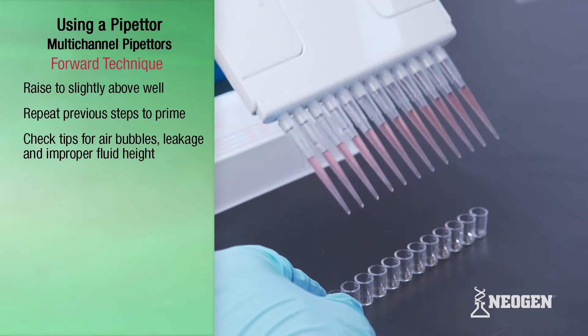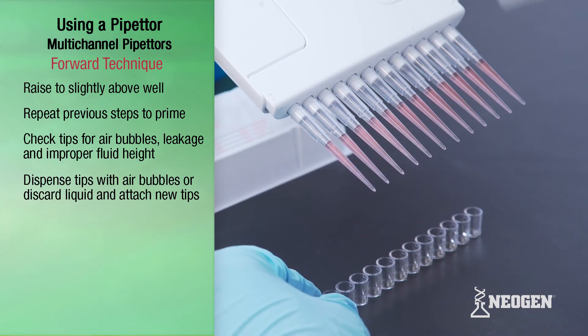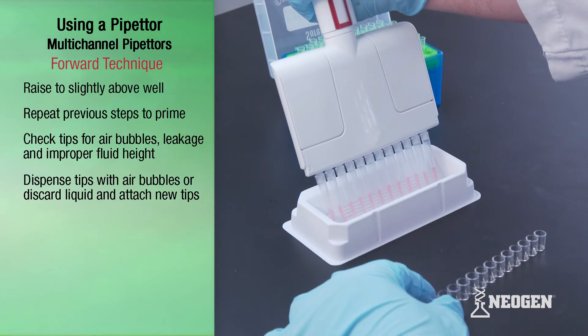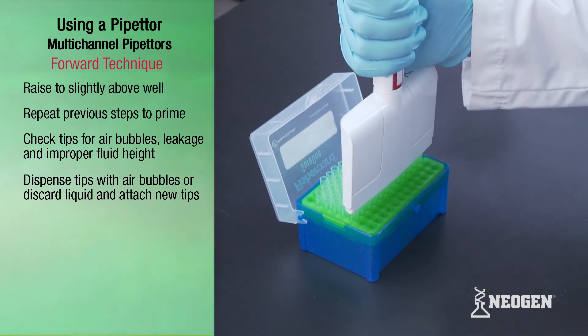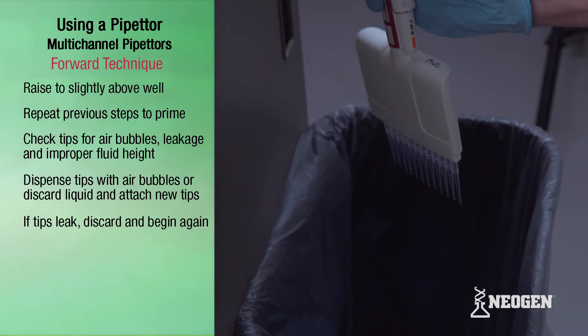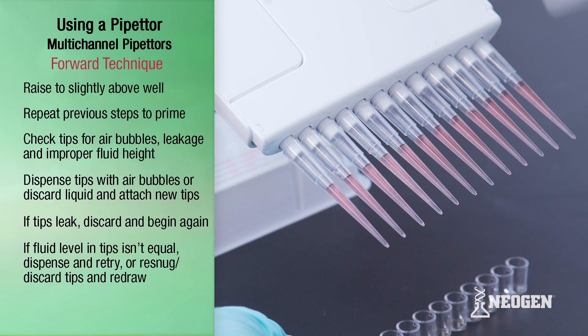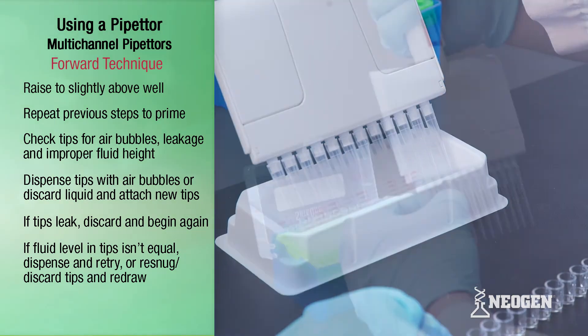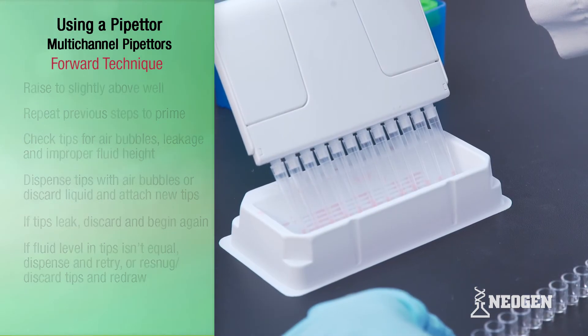Check the fluid in the tips for bubbles, leakage, and fluid height. If you see any air bubbles, dispense and redraw the liquid following the same procedure, or dispense the liquid and attach new tips. If tips are leaking, discard and begin again. If the liquid in the tips are not all at the same fluid height, dispense liquid back into the wells or reagent boats, re-snug or discard the tips, attach new ones, and redraw.